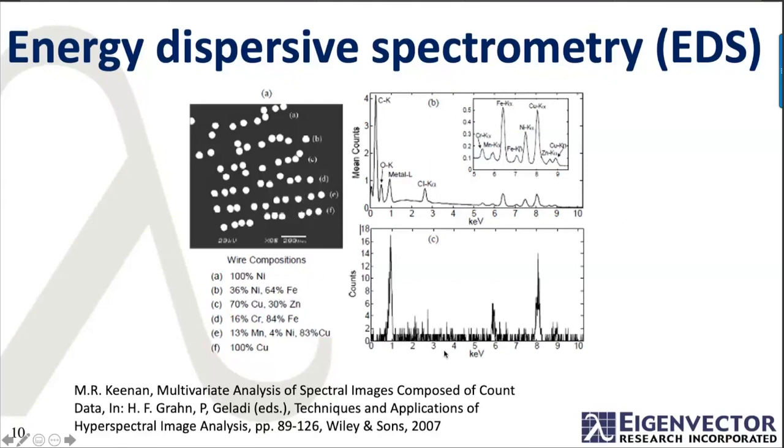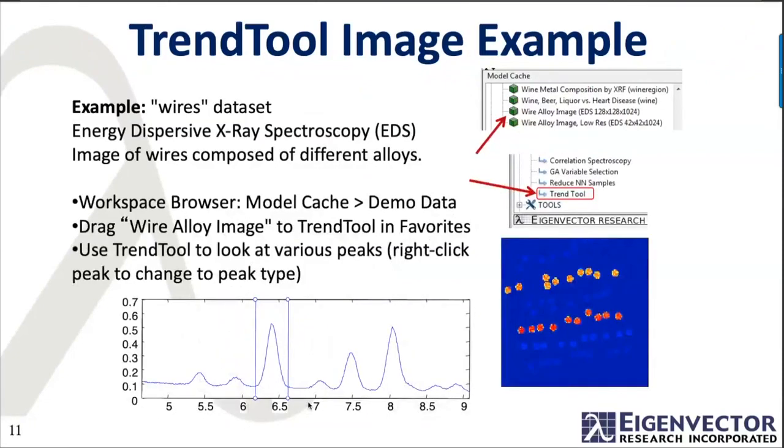In this image, a typical spectrum actually looks like this. It's pretty noisy. This is count data, and this is 1 right there. So the features in this are pretty rough, so to speak, because the number of counts is not high. And here's the reference in this data set. But this is really a pretty fun data set, as we'll see here in a minute. And we'll give you some examples here.